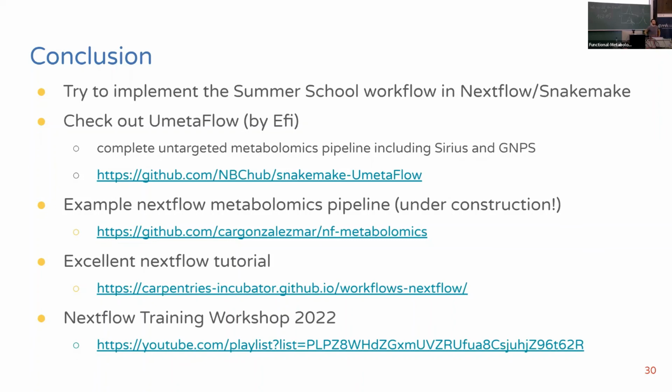How easy is it to connect to APIs, particularly thinking about GNPS or maybe SIRIUS? Is it even possible to launch CSI:FingerID directly from the Nextflow workflow? It's very easy, actually. You could run SIRIUS in headless mode, in the command line interface, and make a process for that with the script and put in your input files.